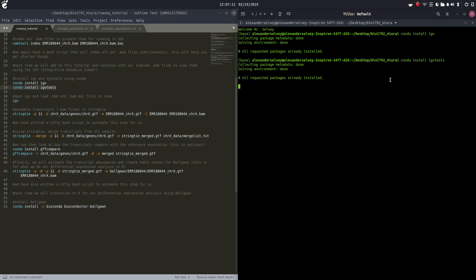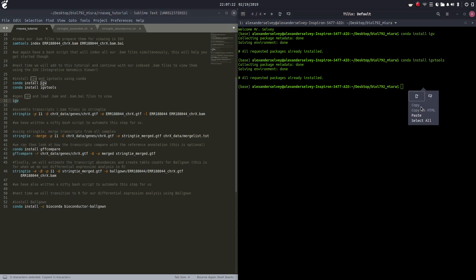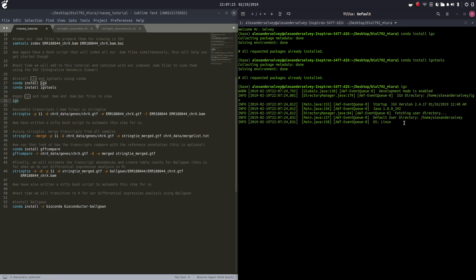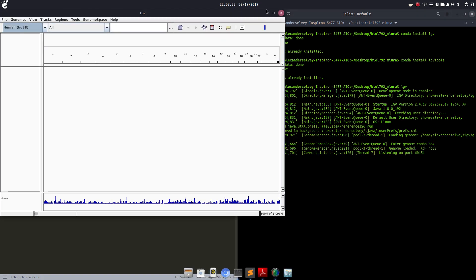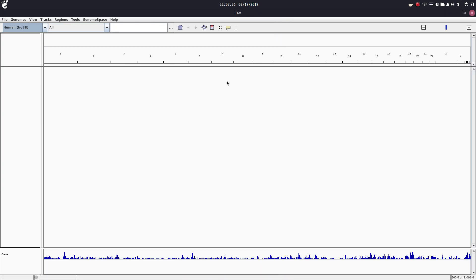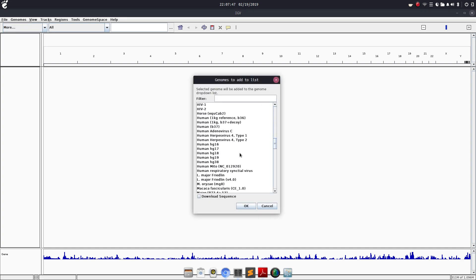That's bioconda miniconda - super awesome conda command and you can install pretty much anything program-wise. It lets me know that it's already installed, so let's run this piece of code and open up IGV now. Here's the IGV, the Integrated Genomics Viewer, we are working with HG38.